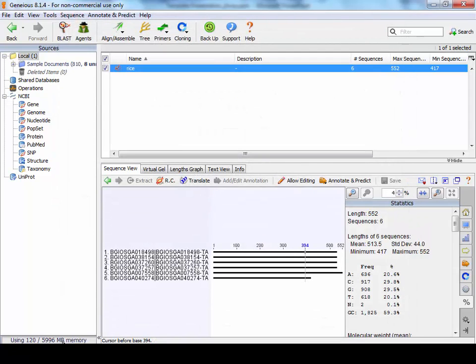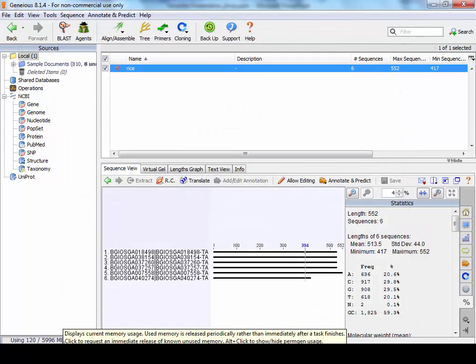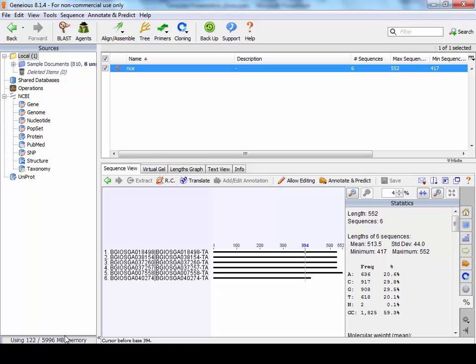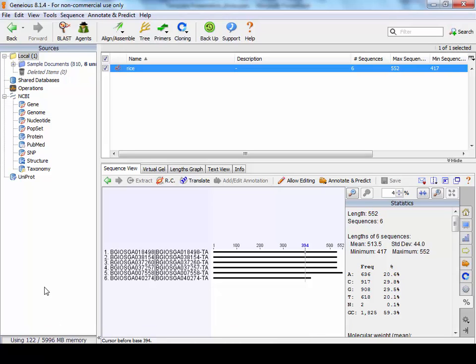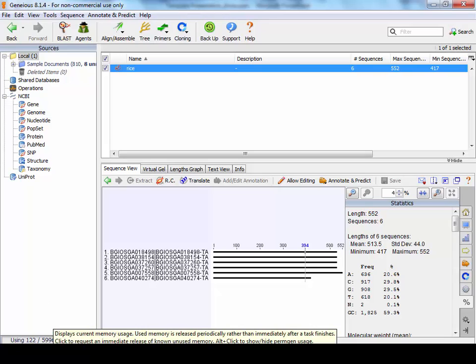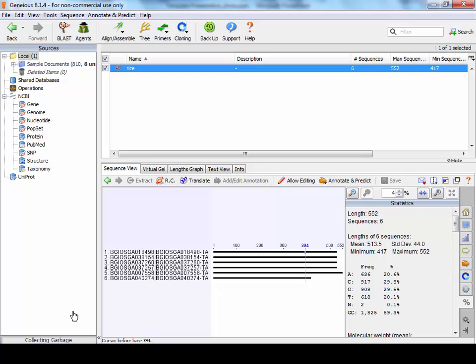And it should say down here, once you restart, how much gigabytes of RAM that you're using. And if you ever see that it's gone very high and you're worried that a job may not run, if you click on this, it will collect any garbage that's accumulated in the memory and clear up some room for you. So that's the basic setup of your Geneious.